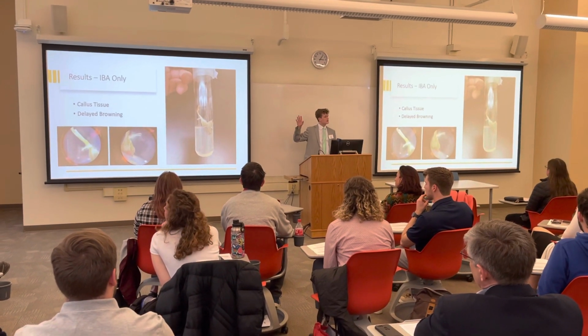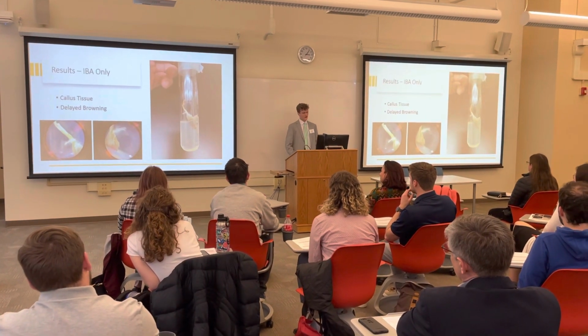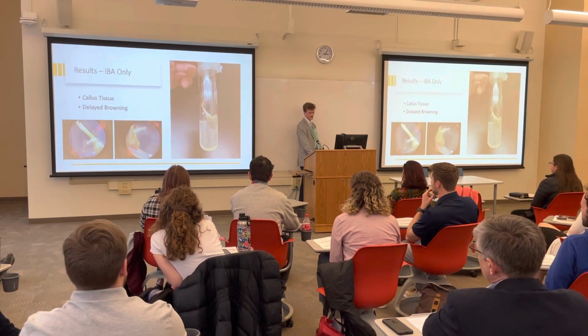It didn't start browning until almost a month after we put them into culture, which is really good because it doesn't interfere. And here are just a bunch of various pictures. You can see roots, you can see callus tissue, which is these blob-looking things there.